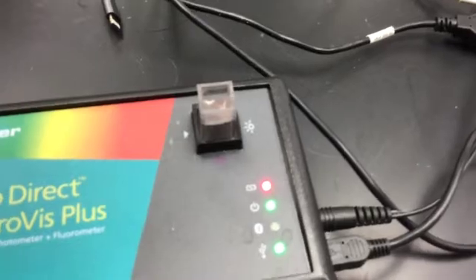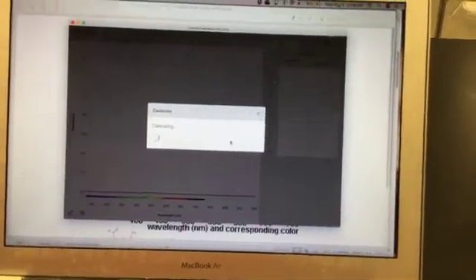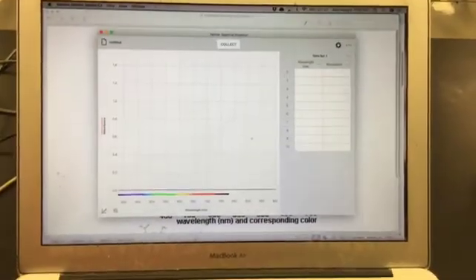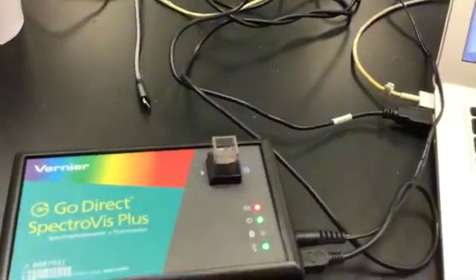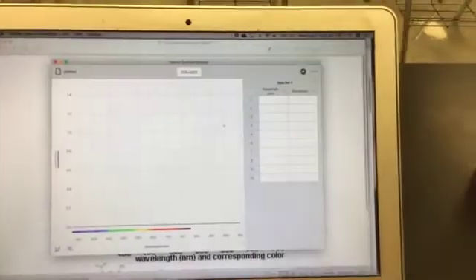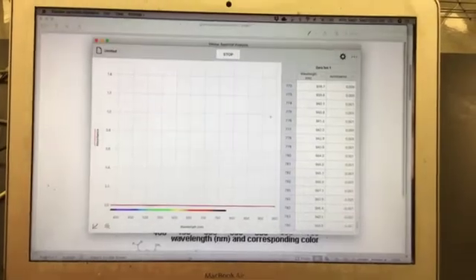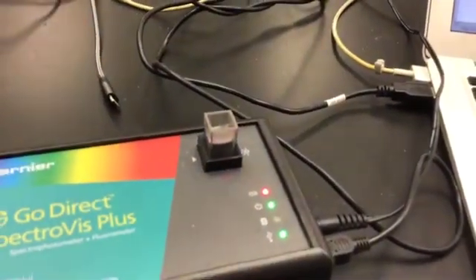So that's just water, a blank cuvette with water in there. And it says, okay, great, finish the calibration. So I'll finish the calibration. What that is doing is basically taring the scale. It is telling the computer to ignore water, and to ignore the plastic device, the cuvette it's called. And you can tell, if I hit collect here, that nothing is happening. It is not absorbing anything because we are telling it to ignore all of these things.